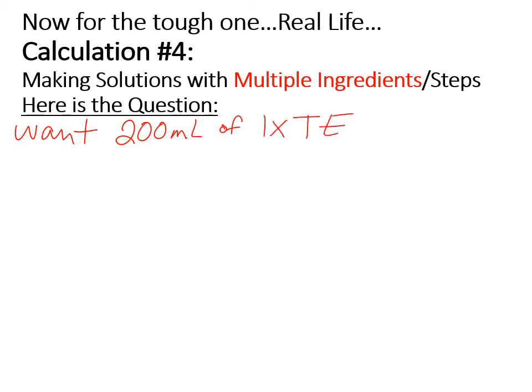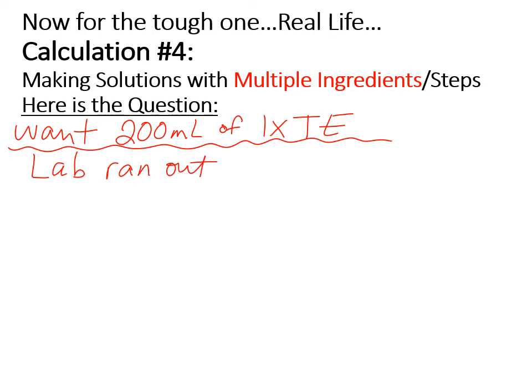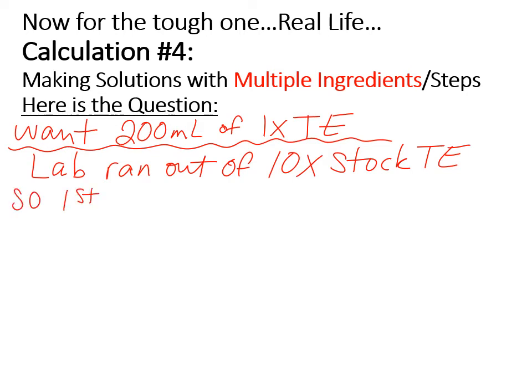Okay, so you want 200 ml of 1x TE, okay? But the problem is, your lab ran out of the 10x stock TE you use to make that. So we're going to write what you need to do first.